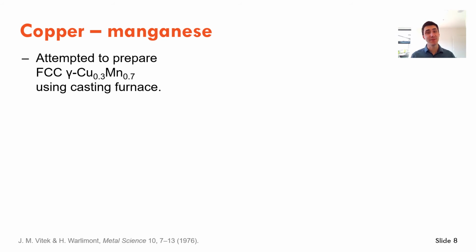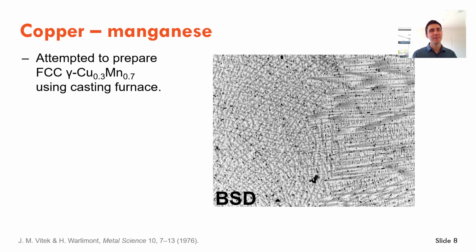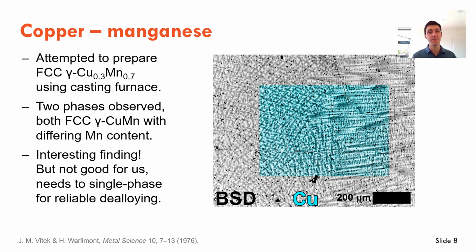So, we tried a similar system: copper manganese. As before, the dealloying acid dissolves the manganese, ideally leaving behind nanoporous copper. We were able to prepare this alloy using an induction casting furnace. Unfortunately, two interpenetrating FCC phases were observed on cooling, each with a different manganese content.